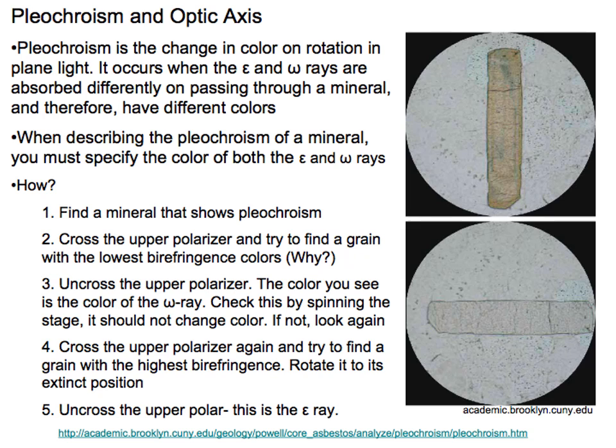And actually, it can be useful to identify pleochroism as another way to identify the extraordinary and ordinary rays and their properties in a mineral. So first, we want to find a mineral grain with very low interference colors, ideally black. So you are looking down the optic axis or as close to it as possible. This is with the analyzer in. That means you are only seeing the ordinary ray propagating along the C-axis. If you remove the analyzer, you can then note the color. So now you know the color of light in that crystal for just the ordinary ray.